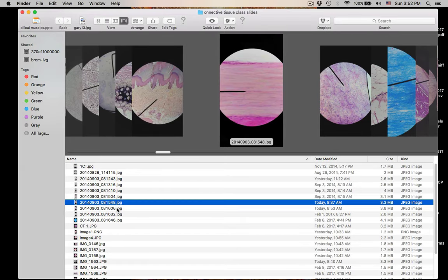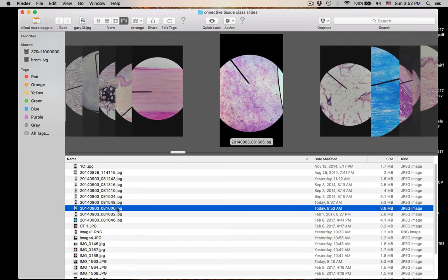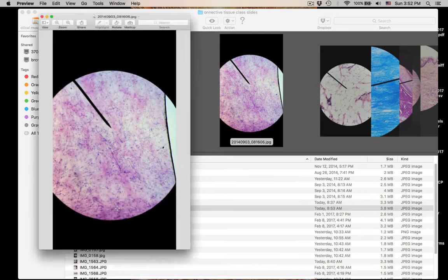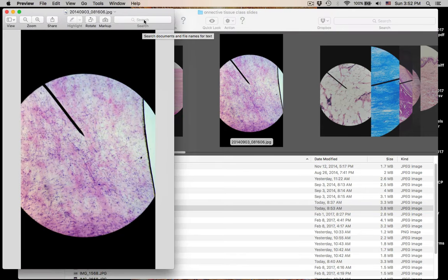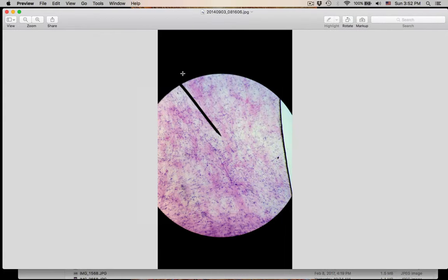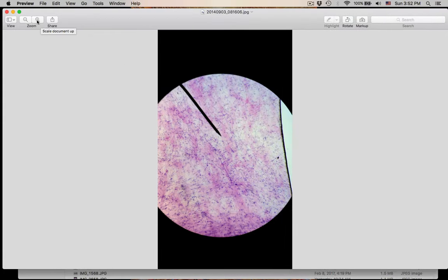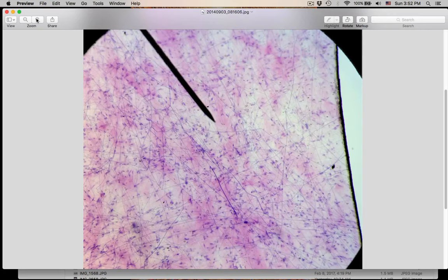Remember, you're going to see multiple examples of the same connective tissue — different staining, not every slide looks exactly the same, but they all have the same pattern. The pointer is in this connective tissue. What is the name of this connective tissue? Number eight.